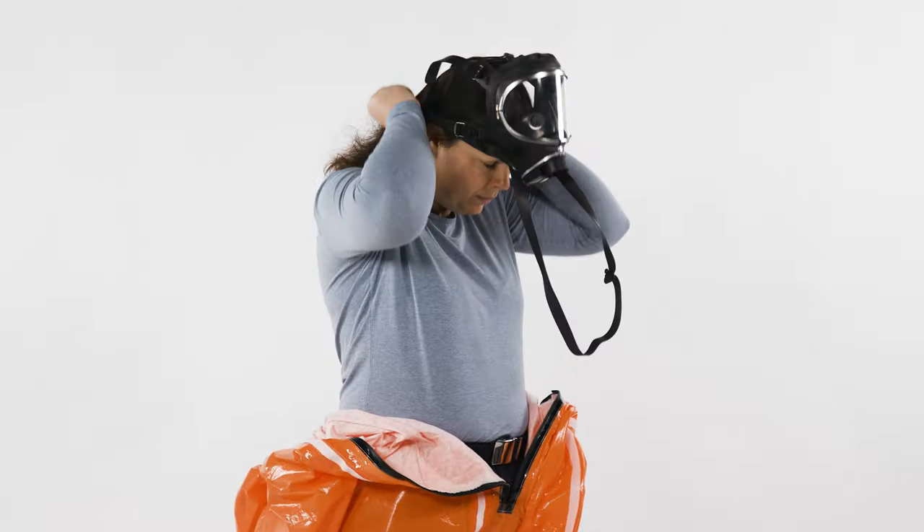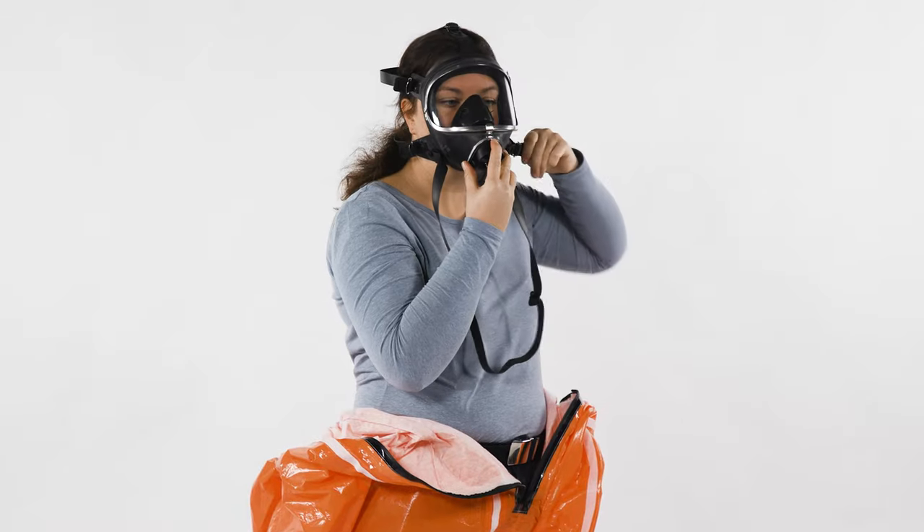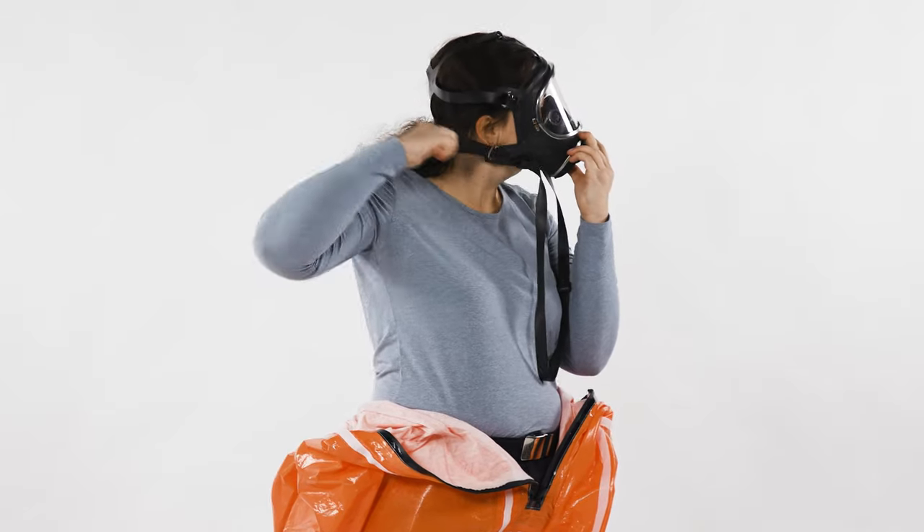Place the respirator on the chin, pull the head harness over the head, and then tighten the harness evenly towards the back.